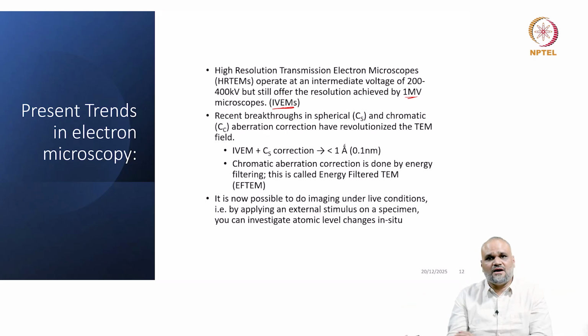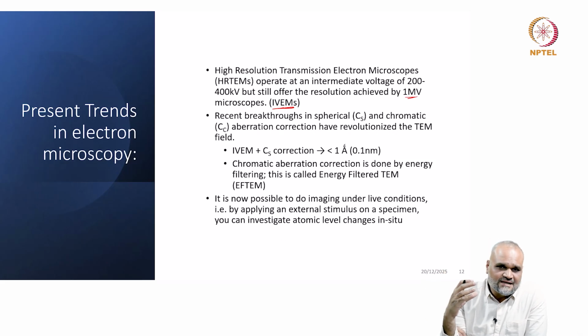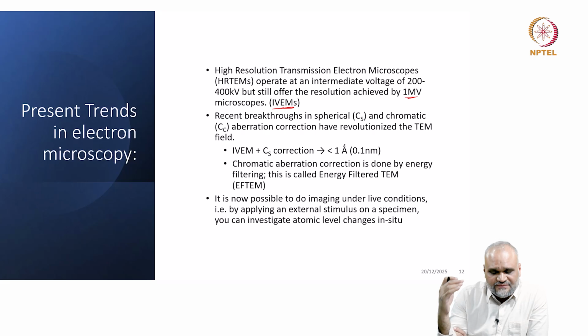There is something called an ultrafast spectroscopy system, and ultra high vacuum systems where you can do deposition along with the microscope column. So there are a lot of advancements going on, and perhaps in the next 3 to 4 years we'll see more of these kinds of microscopes.